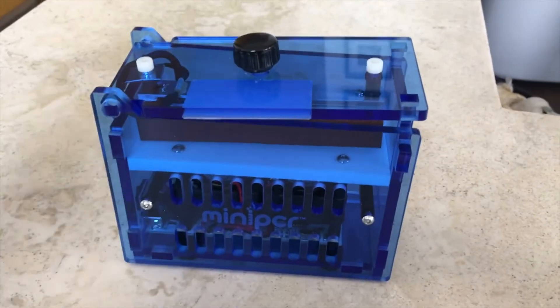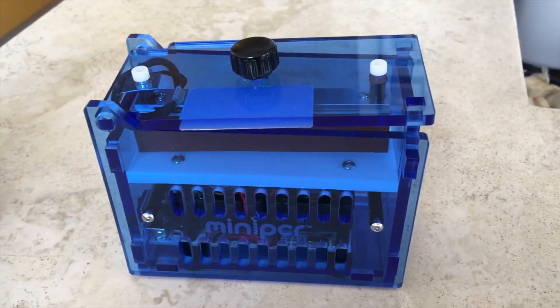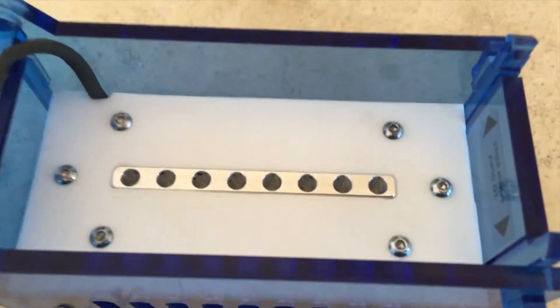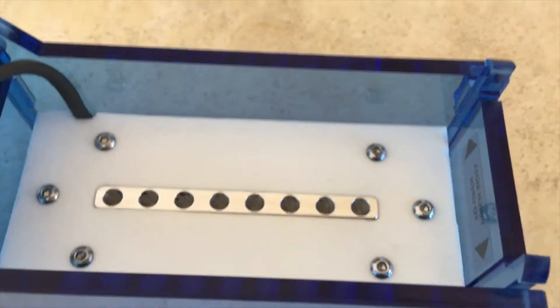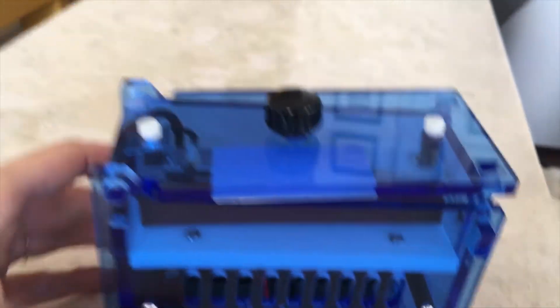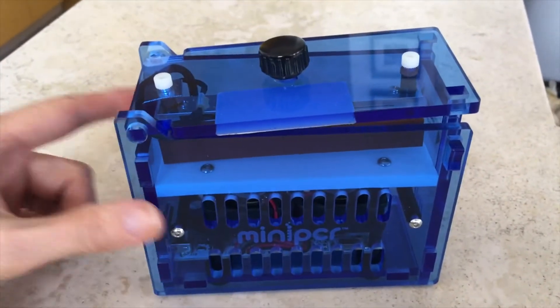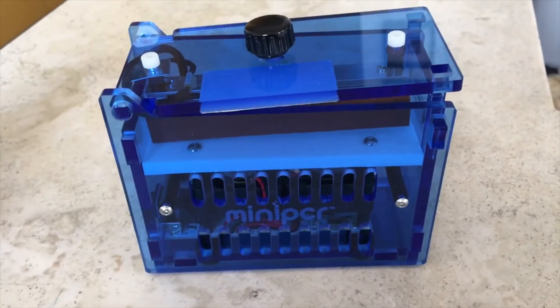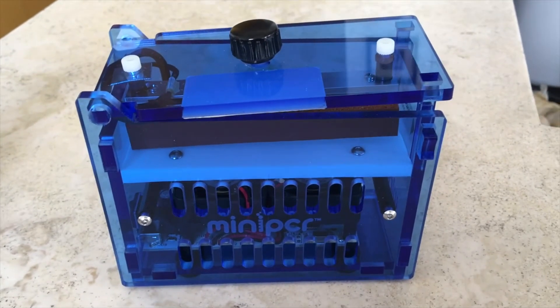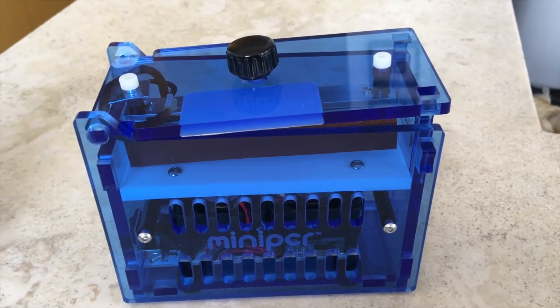The most important piece in all of this is something called a thermal cycler. It's a piece of equipment that connects to your computer and you program it. It's really just a piece of aluminum with eight wells that either gets heated by a heating element or has a fan and gets cooled — we'll learn later why that's important. These cost over $600 new, this one here from a company called Mini PCR. However, if you go on eBay you'll find used ones sold by labs that are a lot cheaper — you can get them for around $300 or so. That's your most important piece.